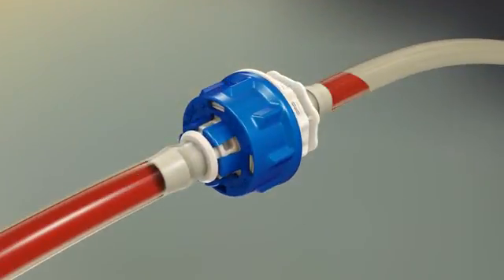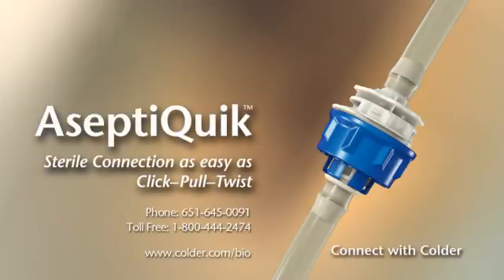You are now ready for sterile fluid transfer. Please contact your Kolder Products representative for additional information on the benefits of AseptiQuick's click-pull-twist technology.